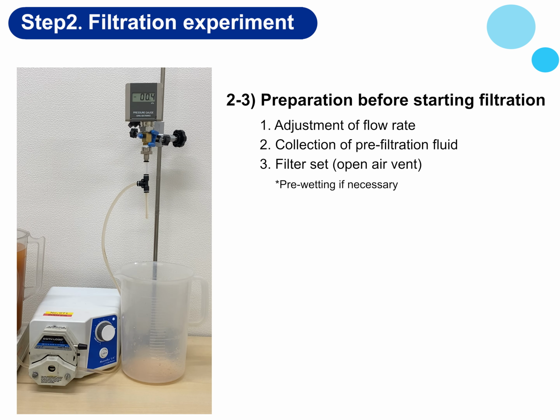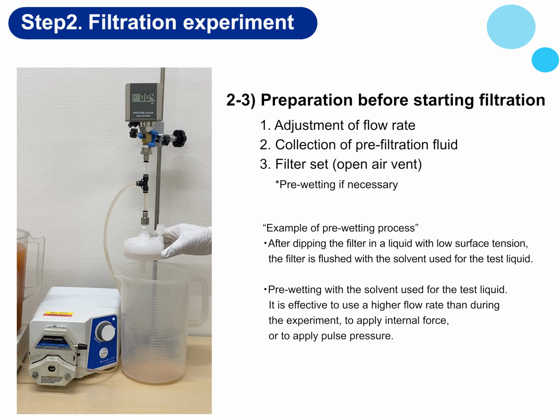Depending on the compatibility of the liquid and filter material, the test filter may have difficulty wetting the liquid with a fine filtration precision filter. In some cases, if the filter is not sufficiently wetted, the entire filter media is not used, and the original filter performance cannot be utilized. In this case, we recommend pre-wetting the filter before experimenting.